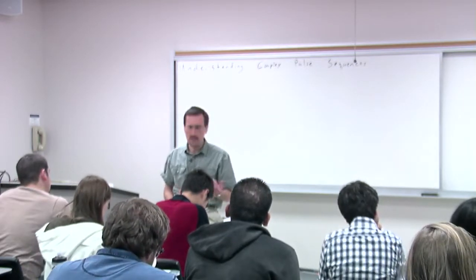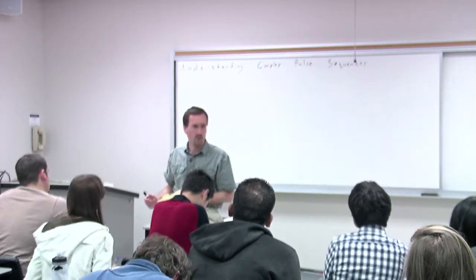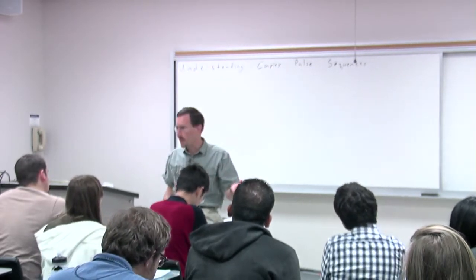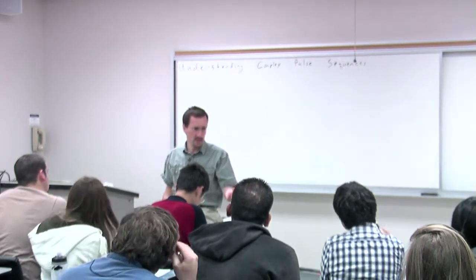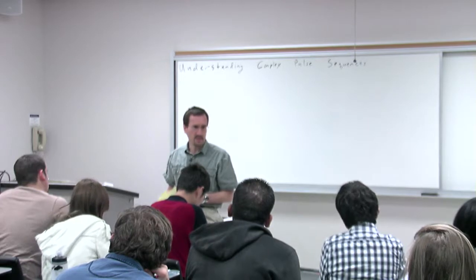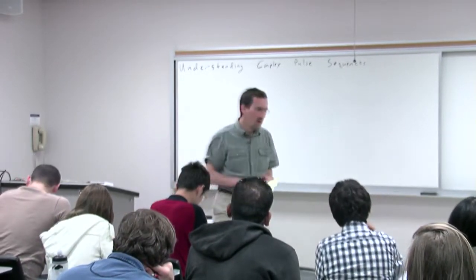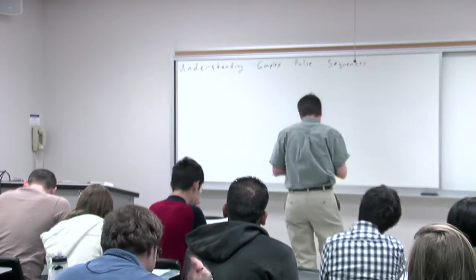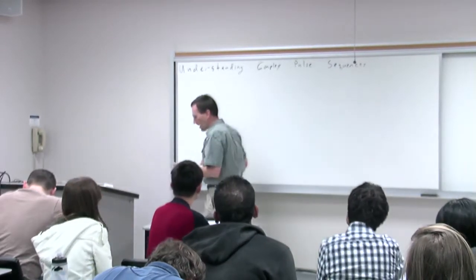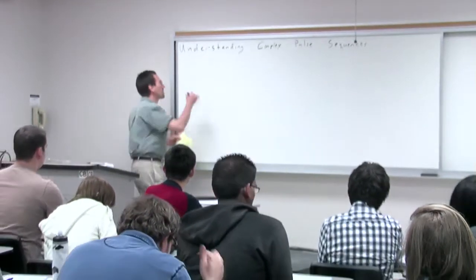So we've already, for example, had instances where people look at their own DEPT spectra and say, wait a second, why do I see in the DEPT 90 a little peak for, say, a methyl group or a little peak for a CH2 group? And a lot of this has to do with parameters, and so that's what I want to give you a feeling about. We're going to start with one experiment that's kind of like a DEPT, but a lot less fancy, and I think it's one that's easy to understand.